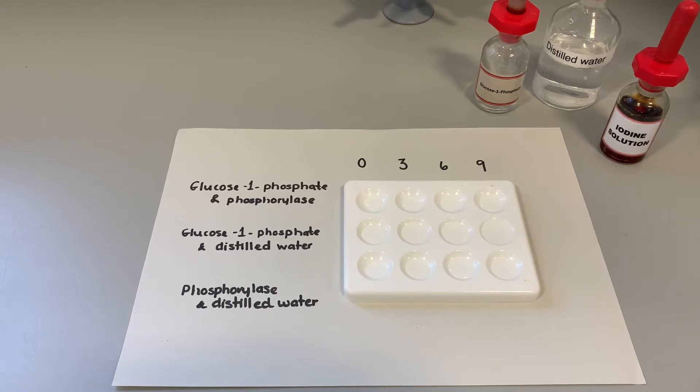So I've already set up some of this experiment. What I haven't added in yet is any of the actual enzyme phosphorylase. You can see that we've got three rows going. The first one is our glucose 1-phosphate and phosphorylase. That's the one that based on what we know we would expect starch to form.